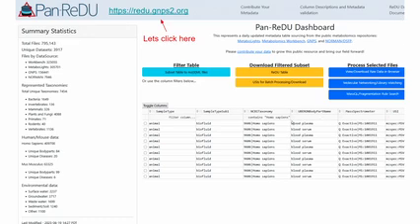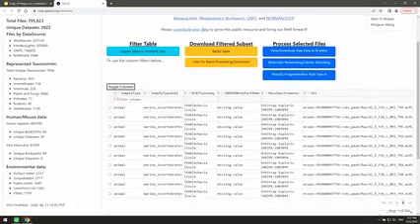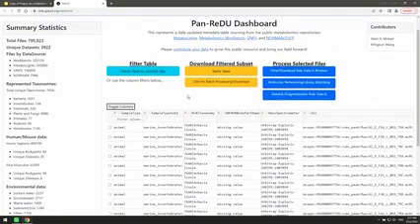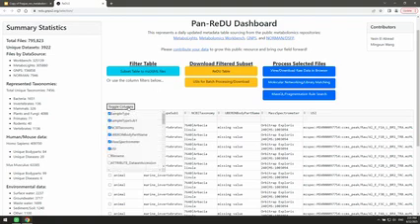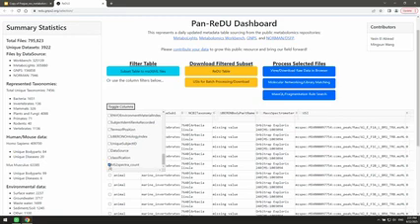I just want you to play around. Actually, I can't do it here because we don't have browser access here, I think. But actually, let me try. Ah, no, it does work. Okay, perfect. So one thing you can do here, for example, is check the columns you have available. I want you to go down here and select, for example, MS2 spectra count.